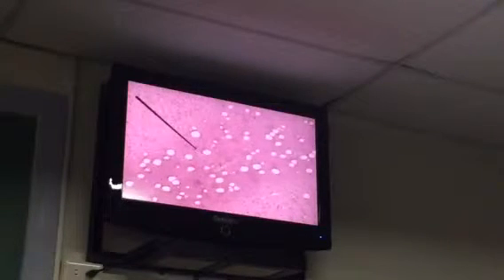The inner area, which is darker in color, this portion here, not so dark in this slide, but this one with holes. The holes, take note, are not normal parts of your cerebral cortex. So the darker area is your cerebral medulla, which is made up of white matter.